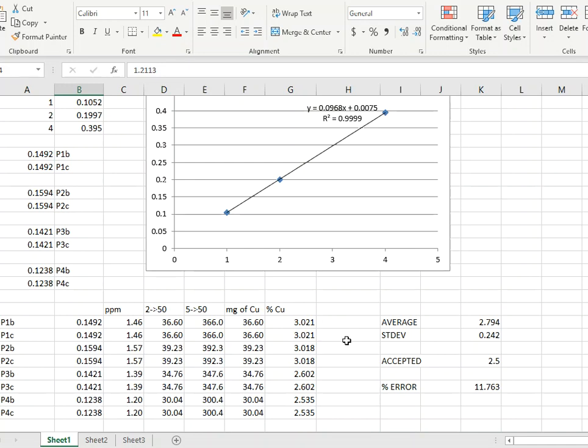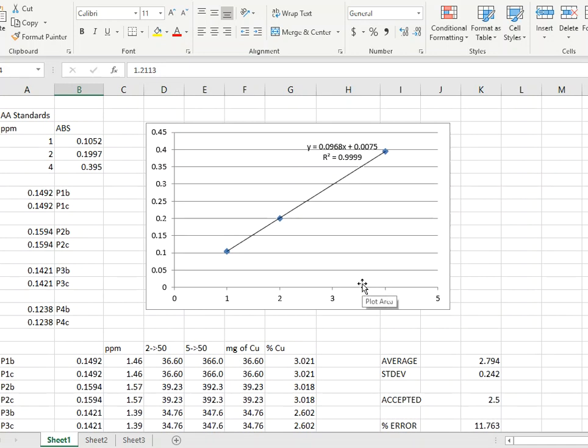Again, Varian or the older AA, doesn't really matter which one you use. Both will give you some numbers that you can use. Not a big deal at all. So just because one looks a little older than the other doesn't mean that it's better or not better.